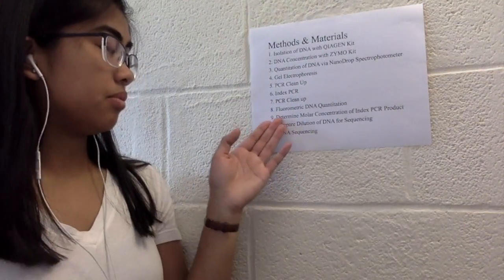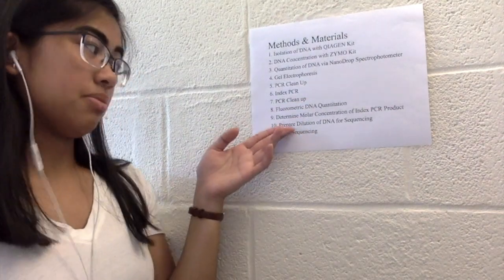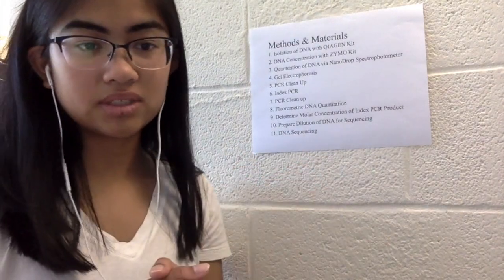Then step 9, we determine the molar concentration of the index PCR product. Step 10, we prepare the dilution of the DNA for sequencing, and then step 11 was the actual DNA sequencing.